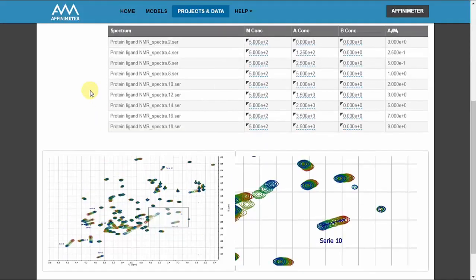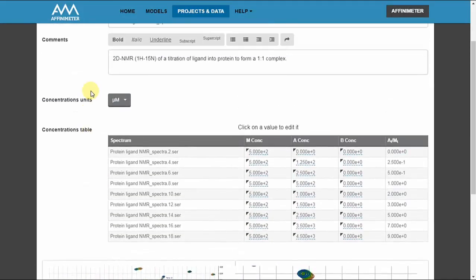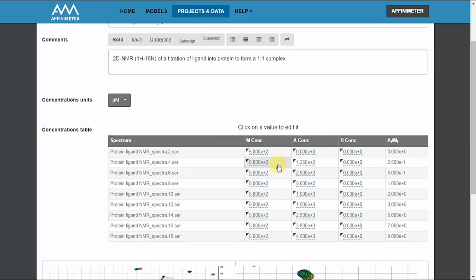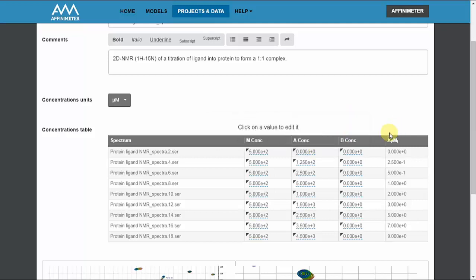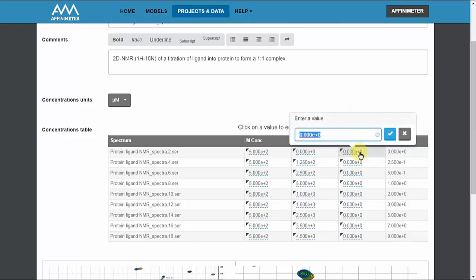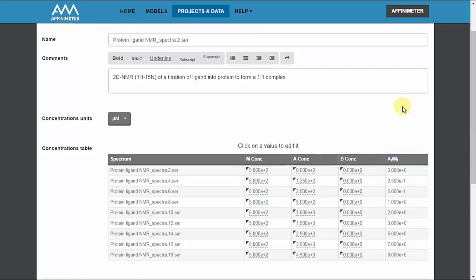Right after data import the table of titrant and titrate concentrations is displayed. In this table it is possible to edit the concentration values and even include the presence of a third species that participate in the interaction.